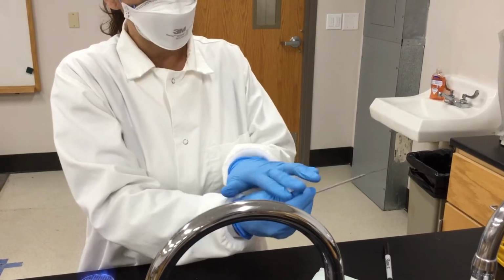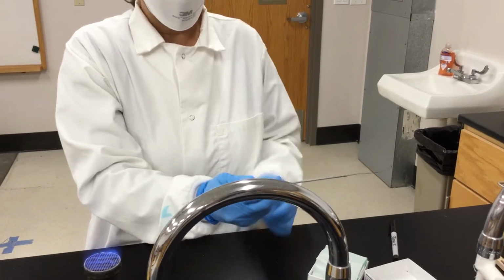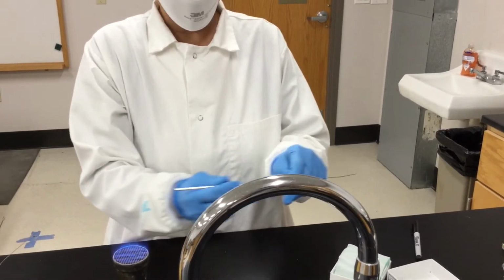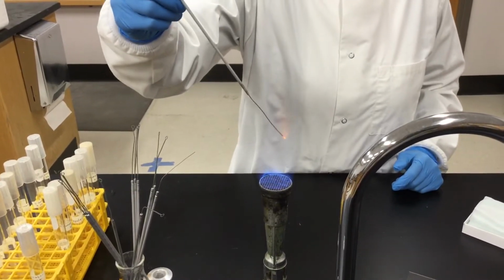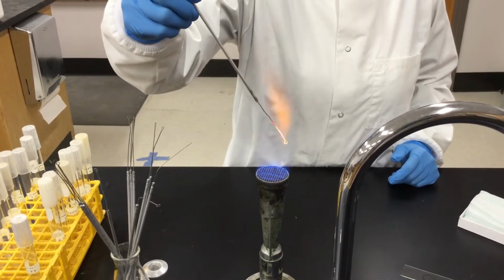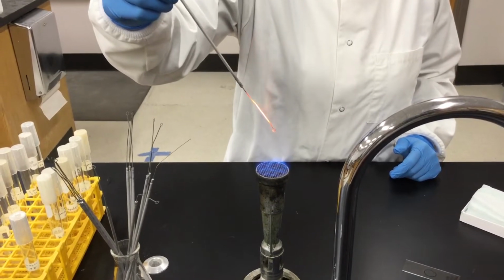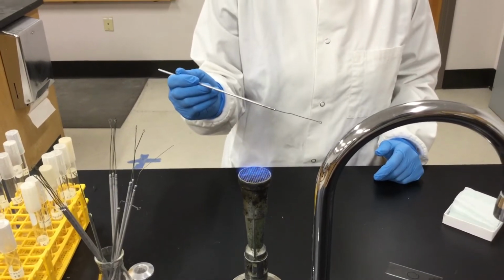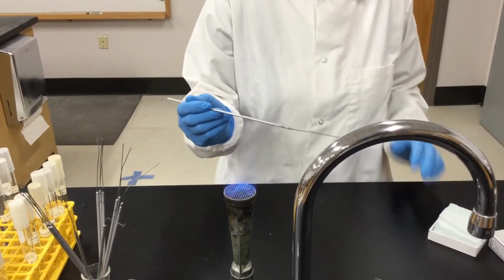And then it has to be in this area of the handle, not too close to the edge, not too close to the part where you have the loop. So it has to be somewhere in here so you don't burn yourself as well. Put it at a 45-degree angle, and notice how the wire is getting red hot, meaning that you are sterilizing this wire. So you withdraw the wire once it's red hot from the flame, let it cool.